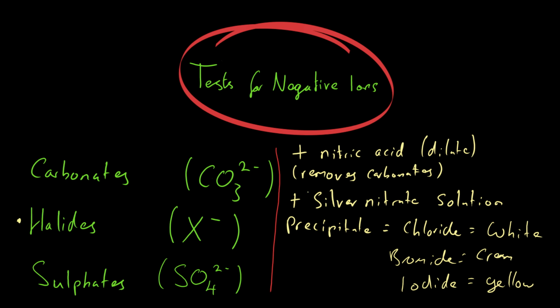Okay, and just like in the last one, I'm going to quickly squeeze the ionic equation in here. So the ionic equation is therefore our silver. Okay, the silver is obviously positively charged in solution, plus our negatively charged halide in solution will form the solid precipitate. I'm just going to put that in straight away. Silver halide. Okay, like so. So silver ions plus halogen ions, which are halides, gives us this precipitate.